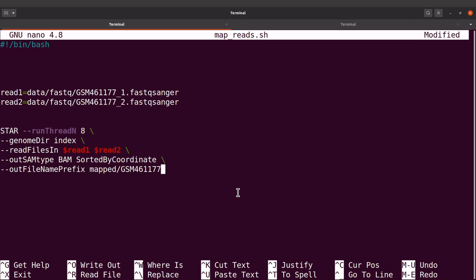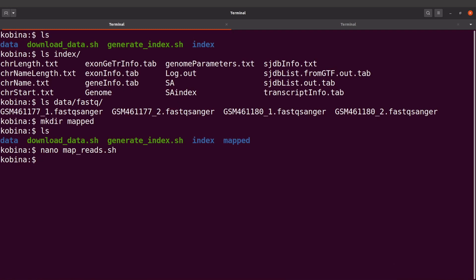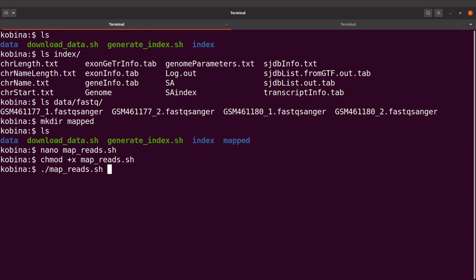The script is now complete. I'll save the changes, then use chmod +x map_reads.sh to add execution rights. Now I can execute the script by calling ./map_reads.sh. This will perform the mapping for the sample we specified against the reference sequence. Let's run this command.